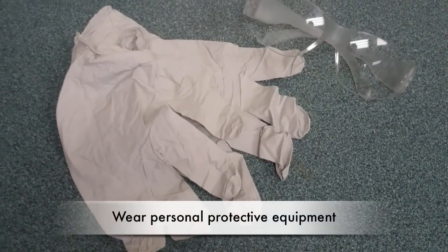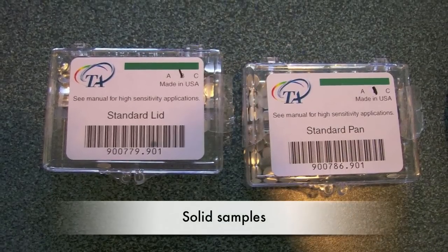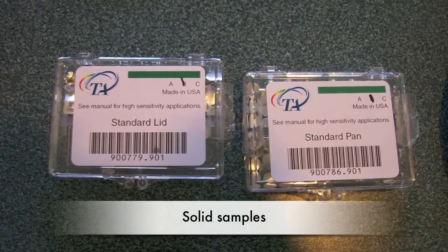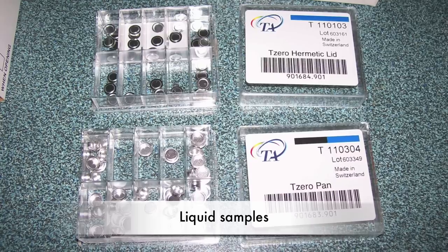Wear gloves and safety goggles when using this machine. The DSC can be used to test any kind of material. Solid samples use the flatter standard pan and lid, while liquid samples use the deeper hermetic pan and lid.